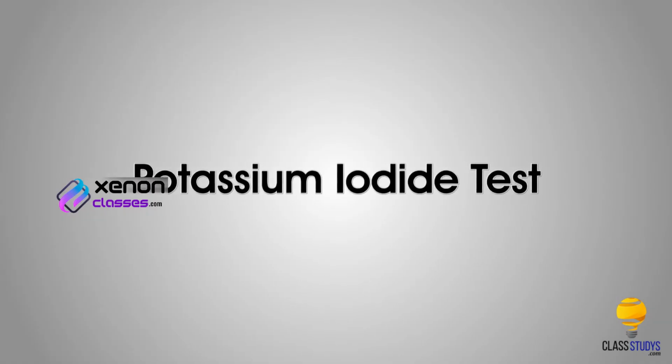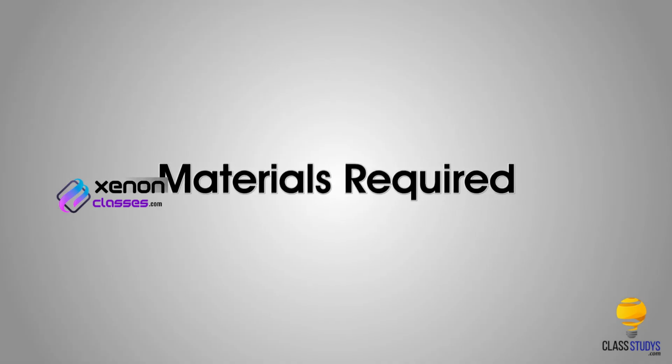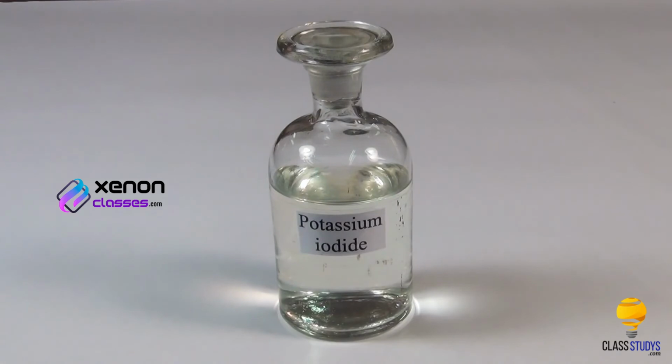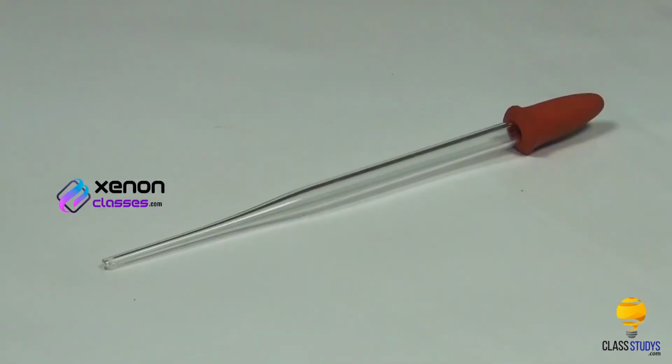Potassium iodide test. Materials required: solution obtained in the group analysis, potassium iodide, test tube, and dropper.